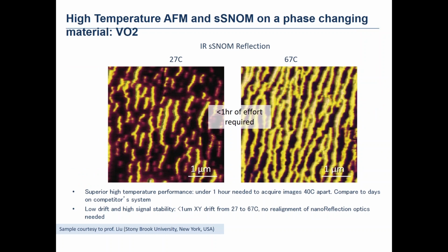In this picture, there is an overlay of the phase optical response and the topography of the sample measured at 2 different temperatures, 27 degrees Celsius and 67 degrees Celsius. One can see that some yellow marked areas in the pictures become a unique structure with growing temperature, which gives the microscopic conductivity.